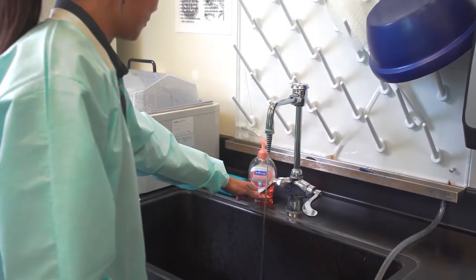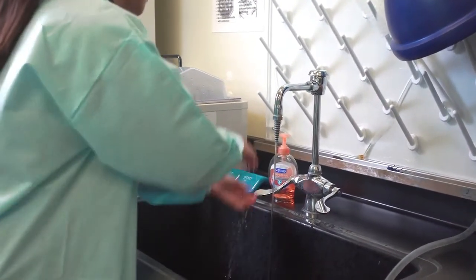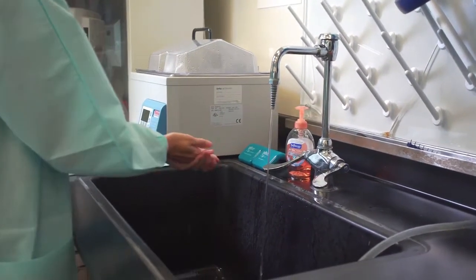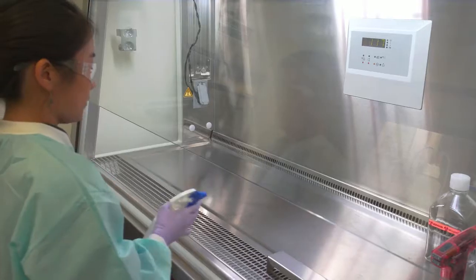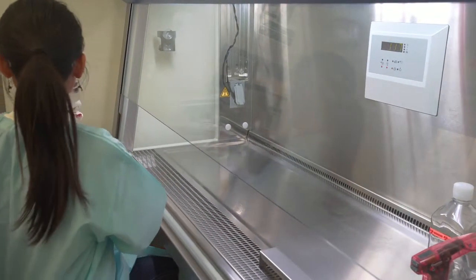Washing your hands before handling cells or performing culture work removes bacteria and microscopic dead skin particles. Dead skin cells can be a potential source of contamination. A 70% ethanol wash kills microorganisms that could contaminate the cultures. Cleanliness is one of the most important parts of sterile technique.